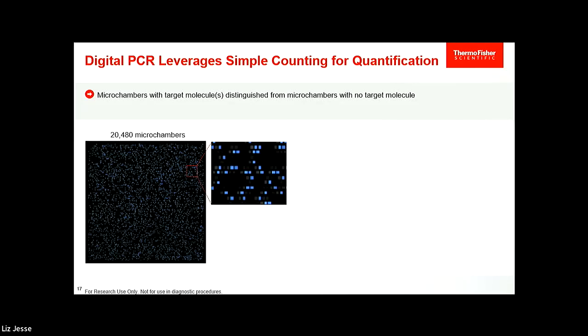As you move into digital PCR that has a much more narrow window, you still want about 20,000 wells to be able to find your range that works for you. The more narrow you get, the harder it is to fall into that window. And so 20,000 is a recognized number for number of microreactions in digital PCR.